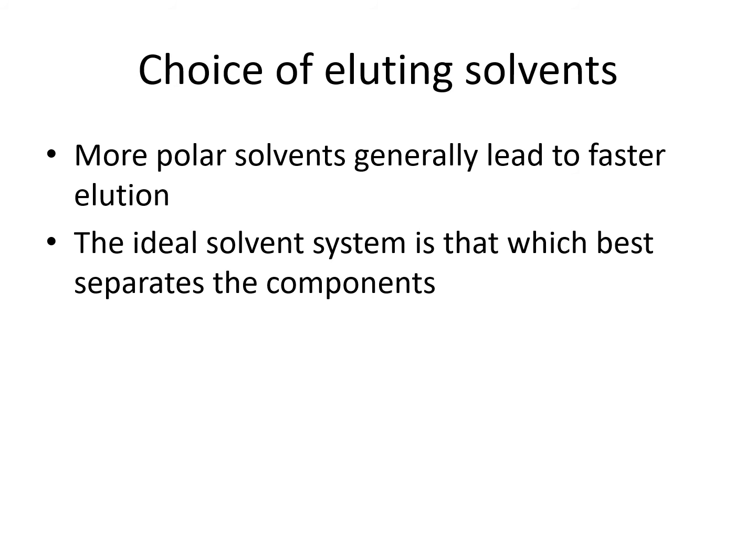Like we said in the beginning, the solvent we use for thin layer chromatography could be a single solvent or a mixture of solvents. It all depends on the material we're using. However, a good solvent for TLC is a solvent that gives us good separation of these compounds.